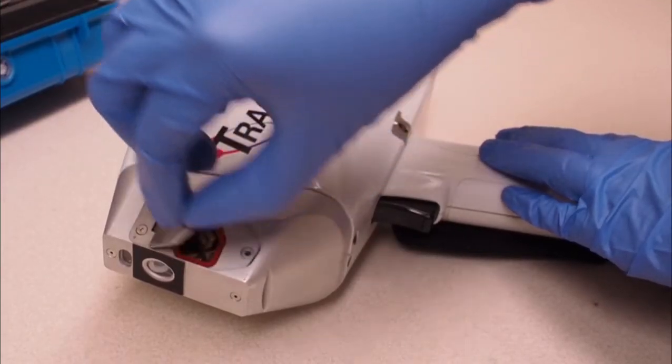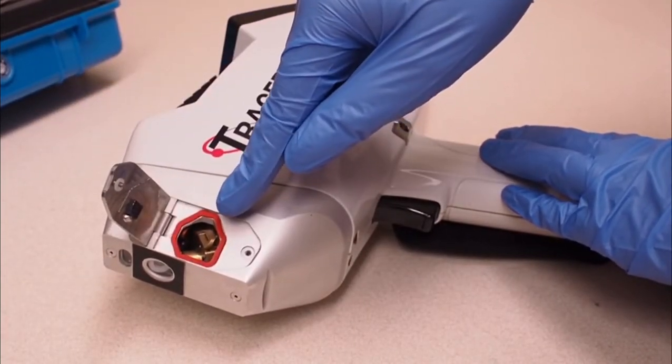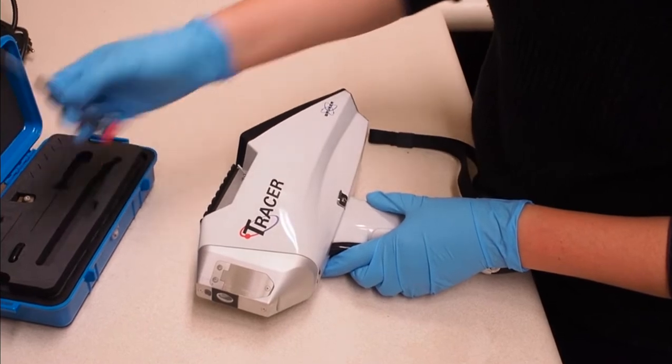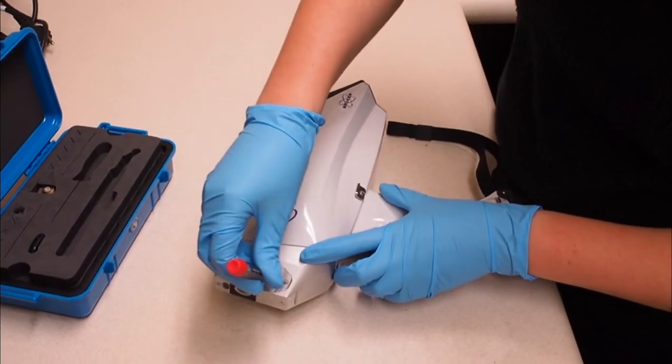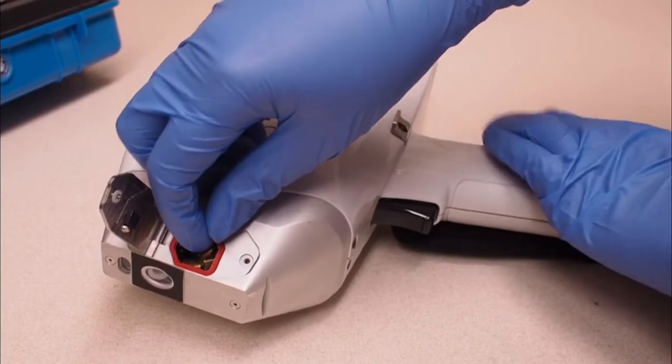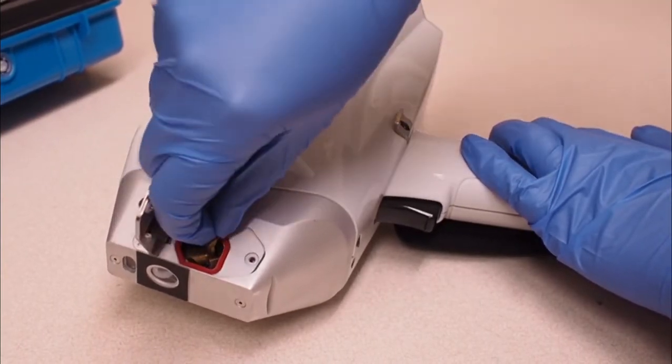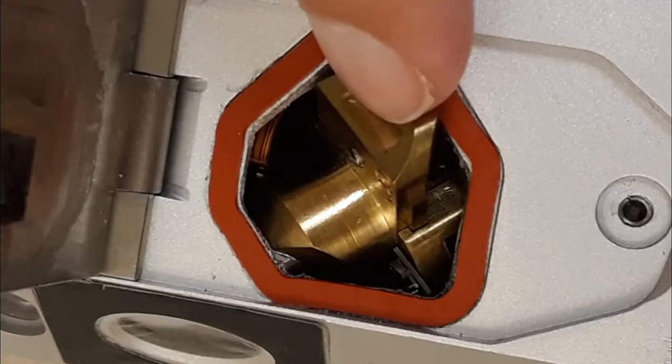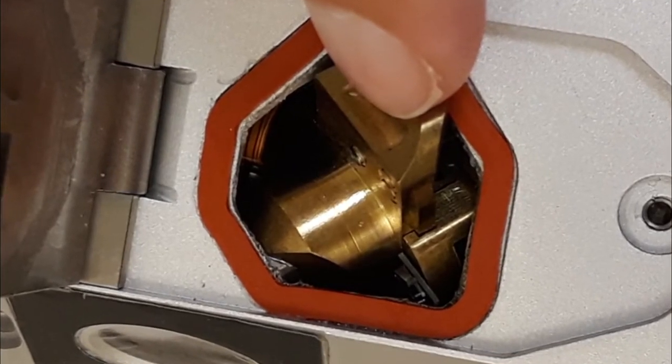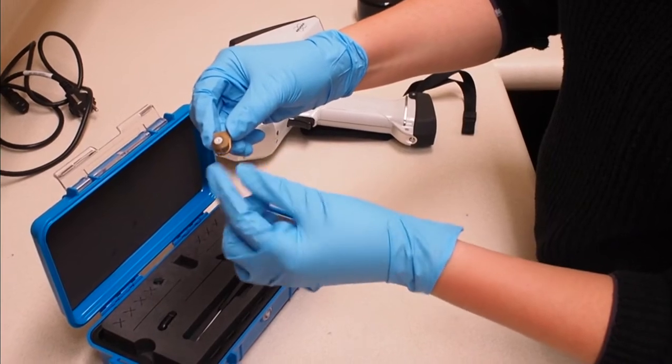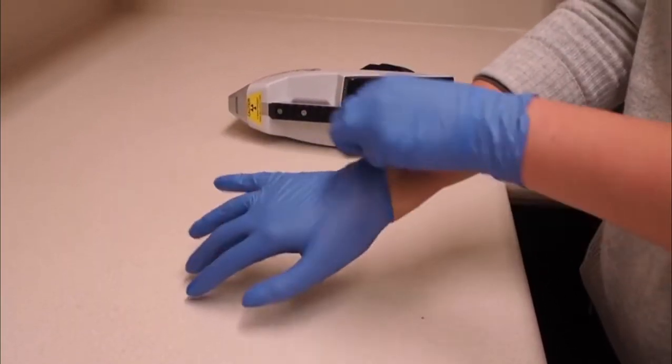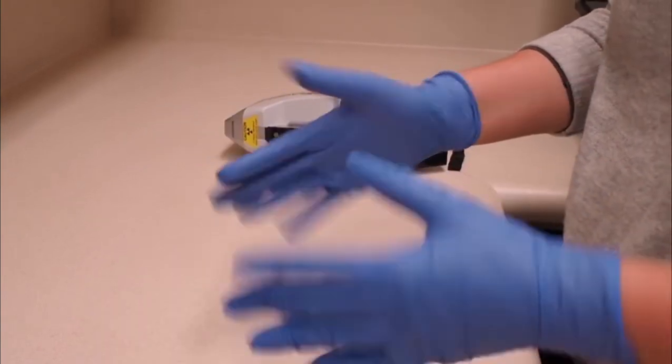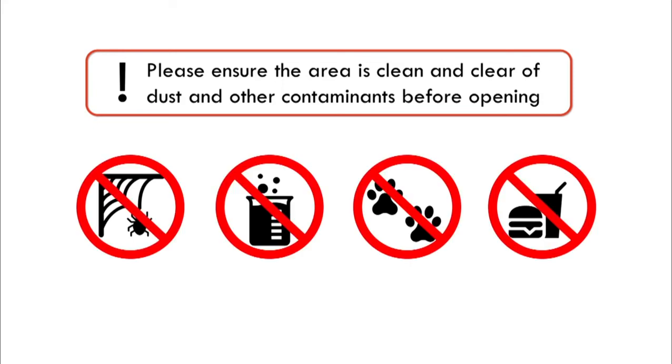One collimator will normally already be inside the instrument when you start it up. If this is not the one you need, you can change it by using the screwdriver to open the side panel near the analysis window. Once open, use your fingernail to gently pull on the collimator by the small thumb hole shown here. Do not touch the head of the collimator. To avoid this risk, it is recommended that gloves are worn. This step should also be performed in a clean space as any time the instrument is opened, there is a chance of particulates like dust or dirt entering the system.